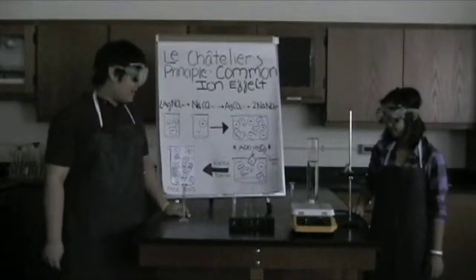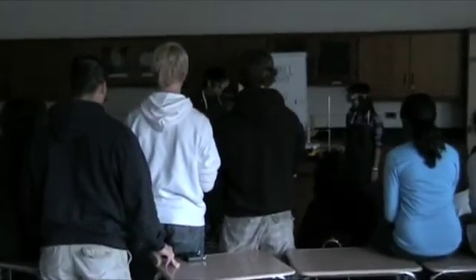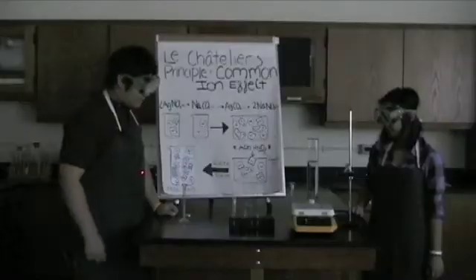Cool. So what's going to happen if we add hydrochloric acid? In class, I learned that if we add hydrochloric acid to something like this, we can get carbon dioxide and water as products. Let's try that.